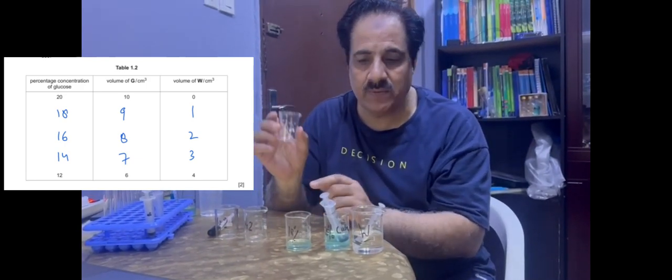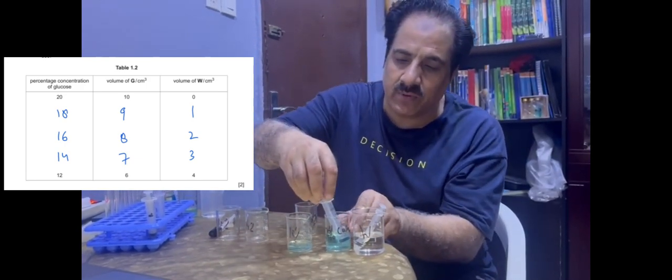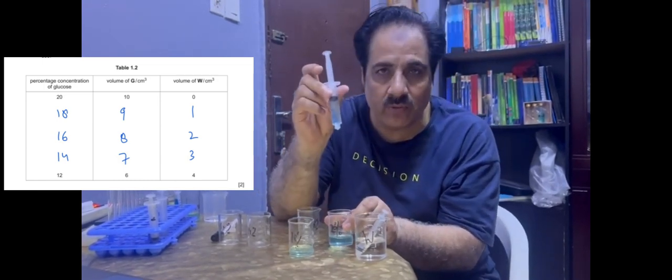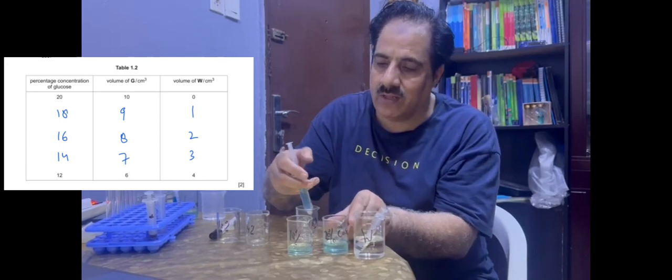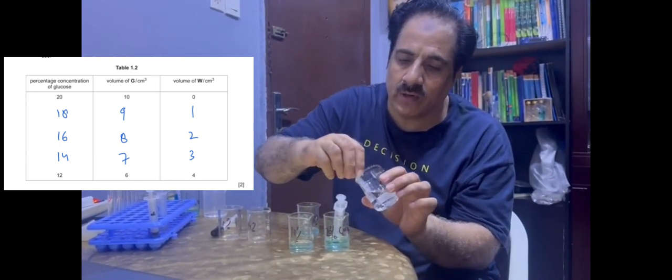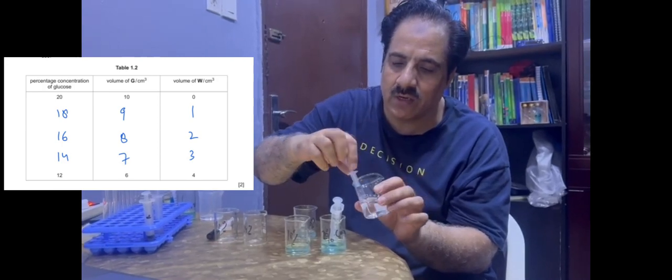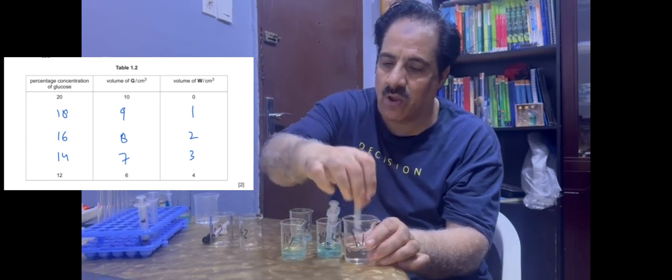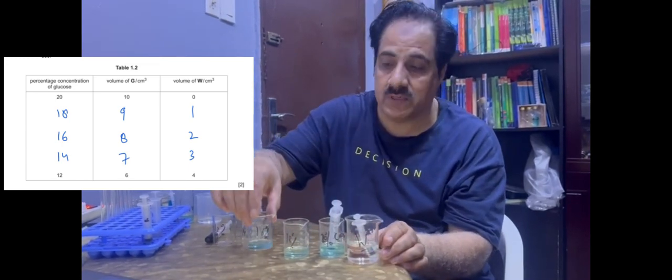In order to make the 16%, we will take 8 centimeter cube as we have made the calculations. This is 8 centimeter cube from the stock solution. We put it in this beaker and we will add 2 centimeter cube of water in this case as the calculations are there. So this is 2 centimeter cube of water. Now this concentration will be 16%.